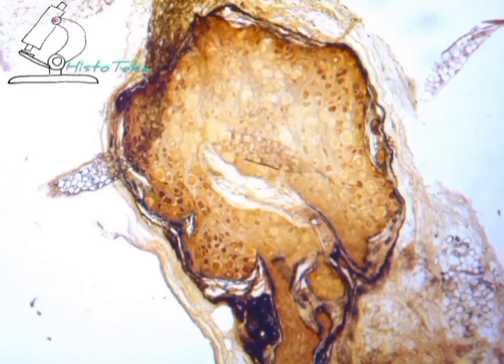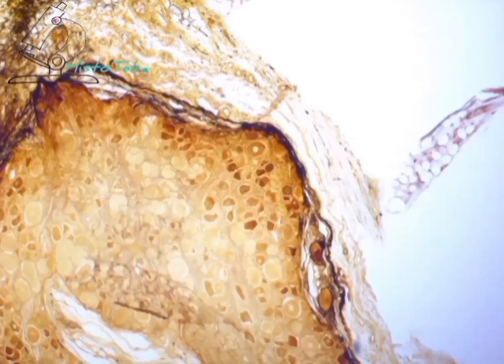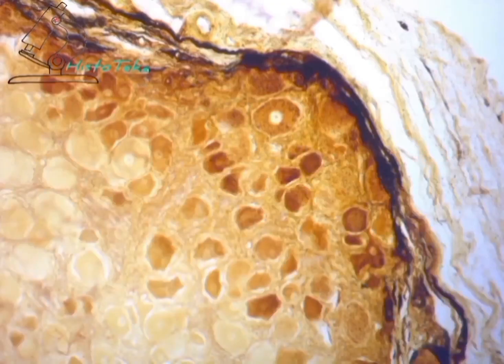The second preparation is a spinal ganglion which is impregnated with silver salts. At low magnification, it is necessary to find the spinal ganglion, an expanded section of the preparation. That's how it should look. The neuron bodies, round-shaped, of different sizes and different color intensity, are clearly distinguishable here.